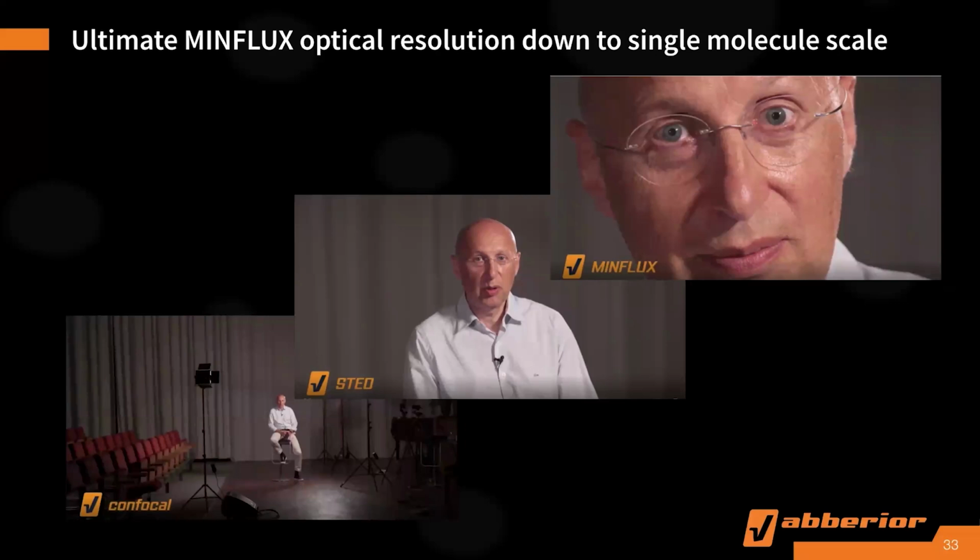On the other hand, if you have very good resolution but you do not magnify, like in the confocal, you can tell this confocal is beautiful, super resolution, but if you do not magnify, you can still not see the details. So if you want to claim this is a super resolution system, you have to magnify the region of interest, then see the details. These two factors you have to keep in mind. So actually, as you see here, MINFLUX will magnify to a single nuclear pore complex, then you see all the details of the single molecules. That's the true super resolution.